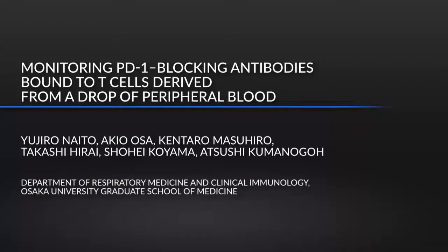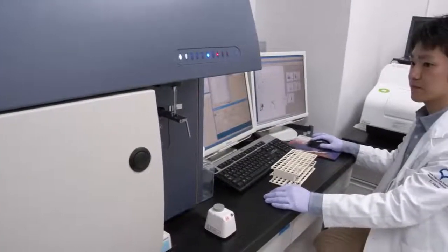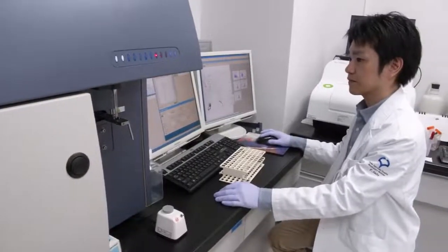Because this method determines PD-1-blocking antibody-bound cells using real blood from patients, the specific subset responsible for anti-tumor effects and immune-related adverse events can be identified. This method needs only a tiny amount of blood sample, and the analyzing process is very simple and quick. It just needs a flow cytometry machine.